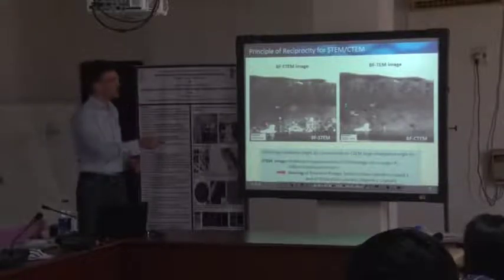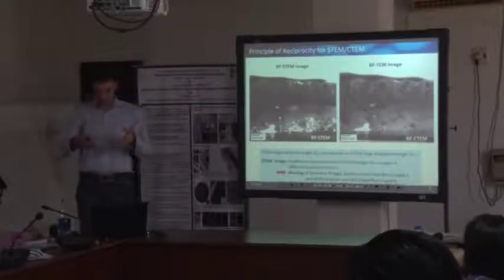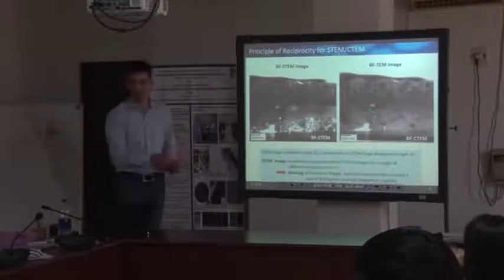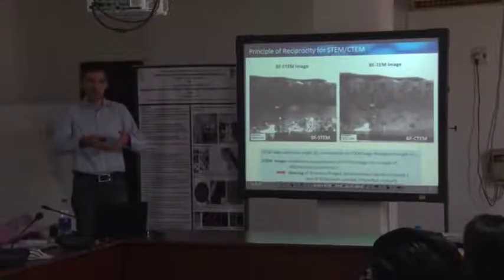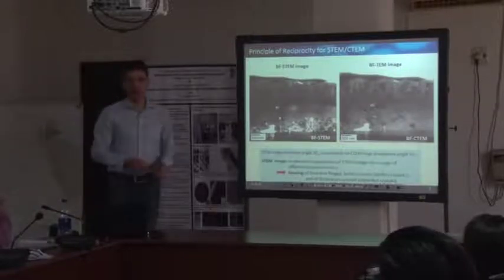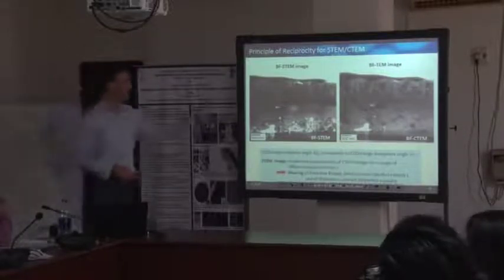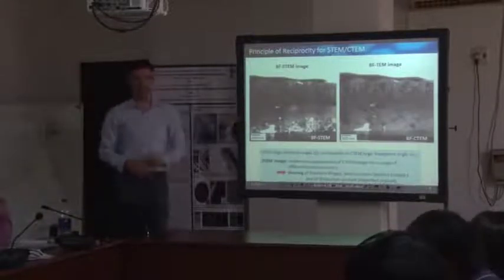In this particular case, we have a parallel beam, and in our back focal plane, we have focused reflections, for a perfect parallel beam in conventional TEM imaging. Here it's just the other way around. Here we have a very fine and focused electron probe, and we get a large angle, let's say, in our reciprocal space. So this is somehow inverted, and I'm not going to go into the details here, but in principle, there are many similarities regarding image contrast.